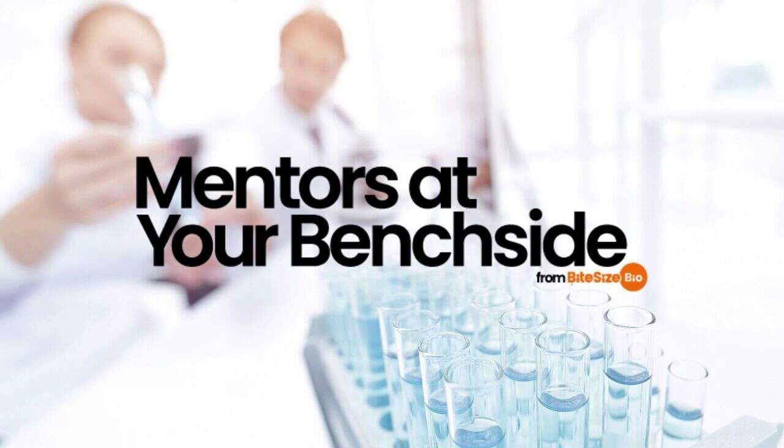So that's it for protein colocalization, Pearson's correlation coefficient and Mander's colocalization coefficient. Both can be used to prove it. The PCC method enables you to analyze colocalization data when it fits a linear model, and the MCC method enables you to analyze fractional co-occurrence data for more complex data sets.